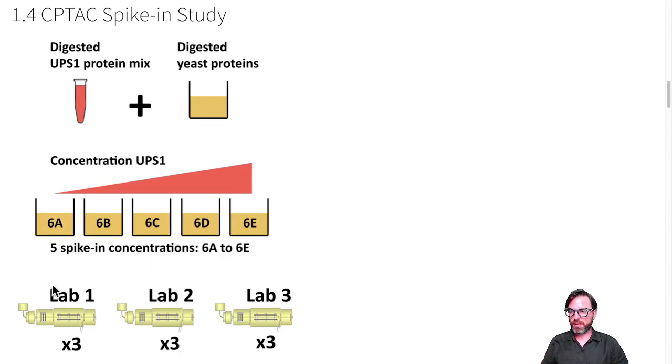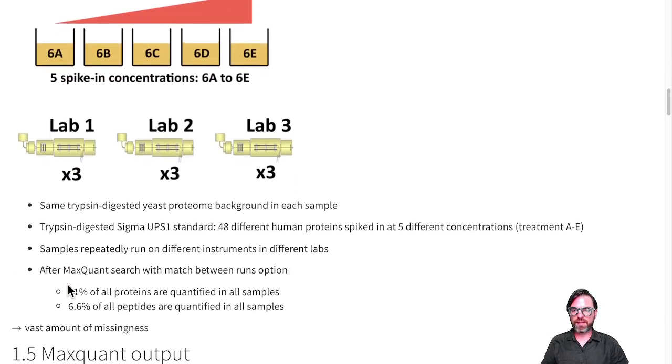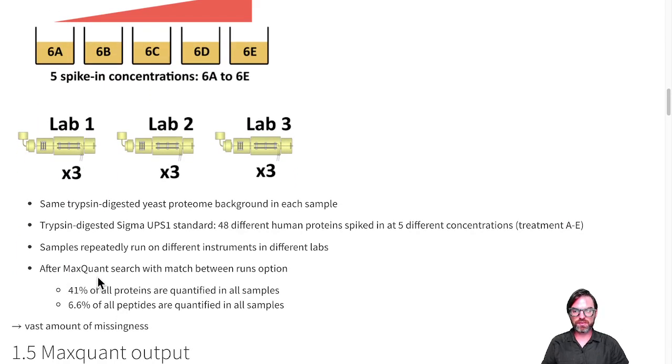This data is publicly available, and we have analyzed the data with MaxQuant, which allows you to do the quantification and the identification of peptides. We have used the match between runs option in order to reduce the missingness.